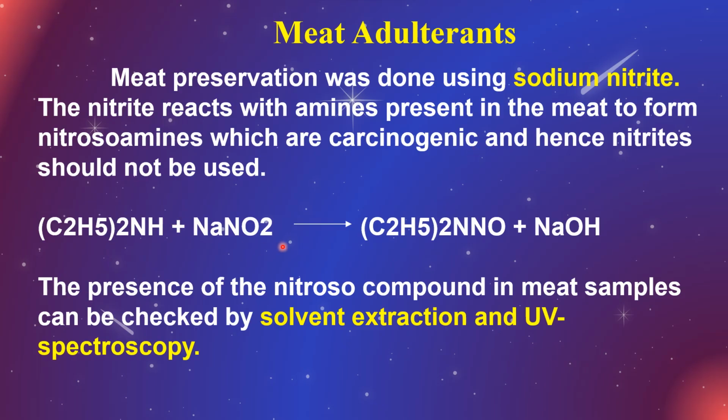How does it retain that? It does this reaction. The amino group present in the muscle with the sodium nitrite will give a nitroso compound, which is carcinogenic. It is not good for health. It can be detected by solvent extraction and also using a UV-visible spectrophotometer.